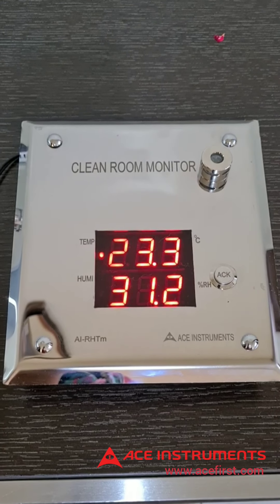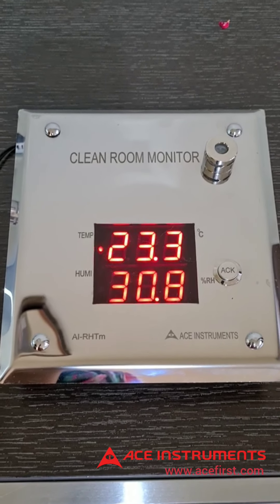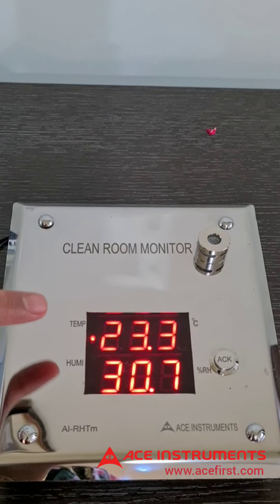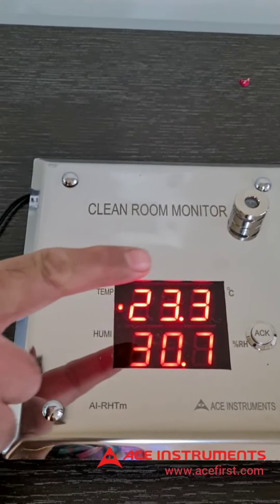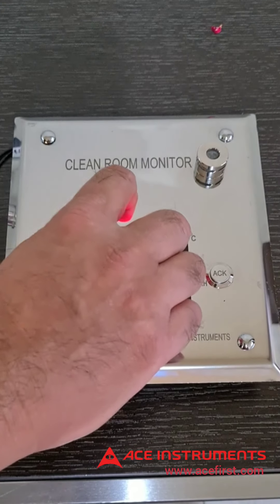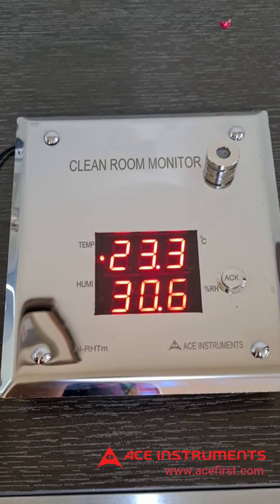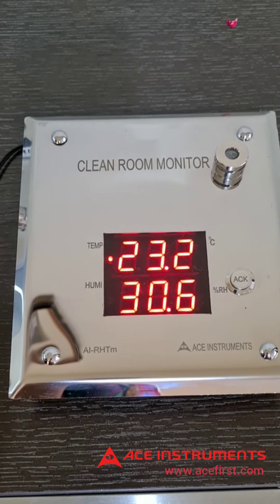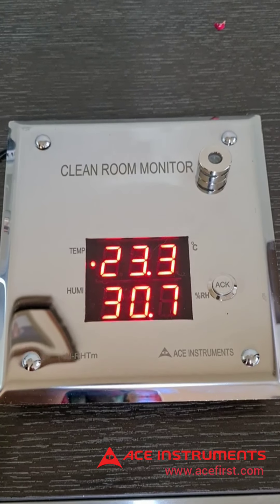These settings are field programmable using the tactile keyboard inside the instrument. It has a two-line display — three digits each, seven-segment red LED, 0.8 inch display height — and measures temperature in degrees Celsius and humidity in percentage relative humidity (% RH).